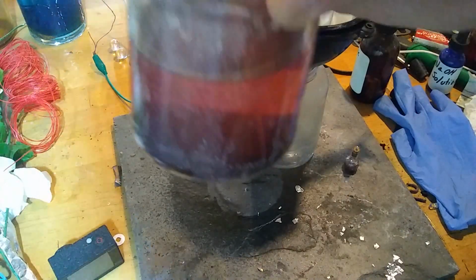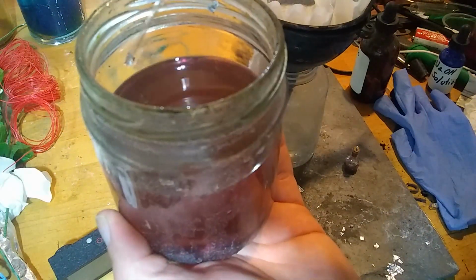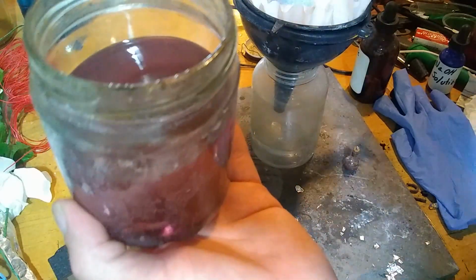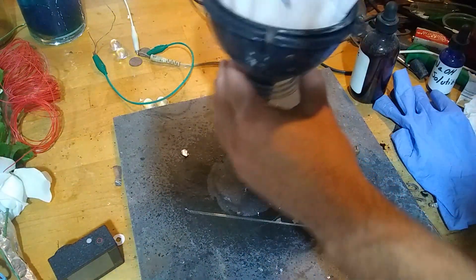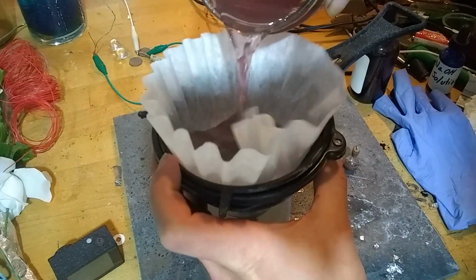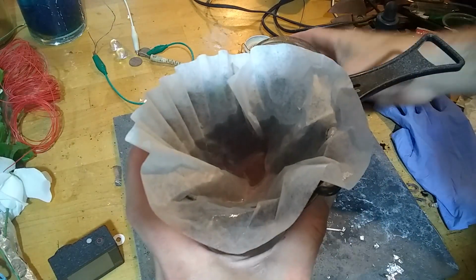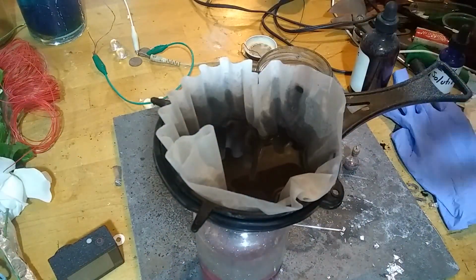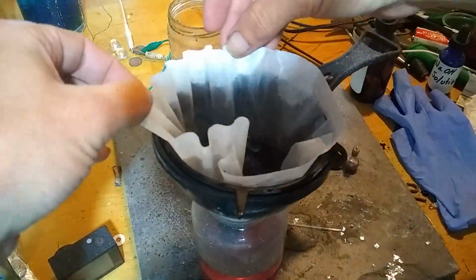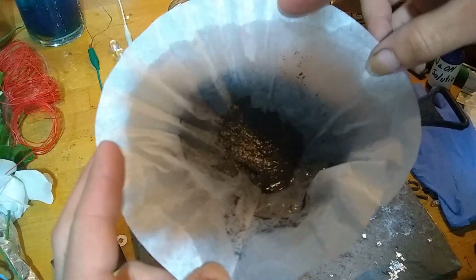All the aluminum has finally reacted, leaving cobalt powder at the bottom, and a bunch of solution that still contains some cobalt, but is going to be very hard to extract on top. So I'm going to filter this out to get the cobalt metal. I am apparently also going to be a total klutz. Now that the solution is filtered through, you can see just how little cobalt that actually is.